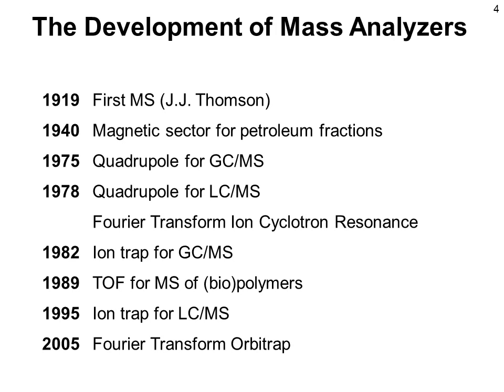In 1975 the Quadrupole mass analyzer was developed, which we will hear about a little bit more later on. It's a very important and widely used mass analyzer, and as mentioned before, the concept was honored with the Nobel Prize in Physics later on. Originally, mass spectrometry was coupled to gas chromatography, which was quite logical, since ions had to be in the gas phase for the mass analyzers to work. So it was logical to use gas chromatography where molecules are already in the gas phase and couple it to mass spectrometry. This is still an important technique to date.